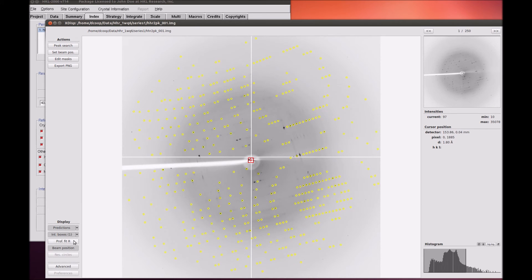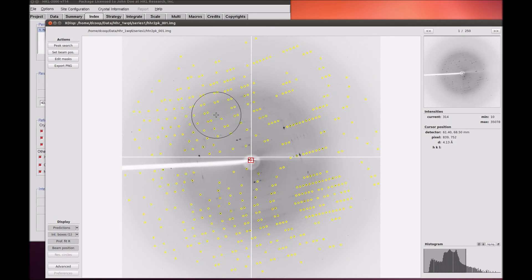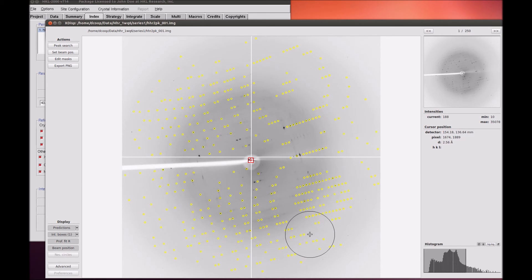The Profile Fitting Radius button can be used to show the size of the area that is used to calculate the expected profile for each reflection.